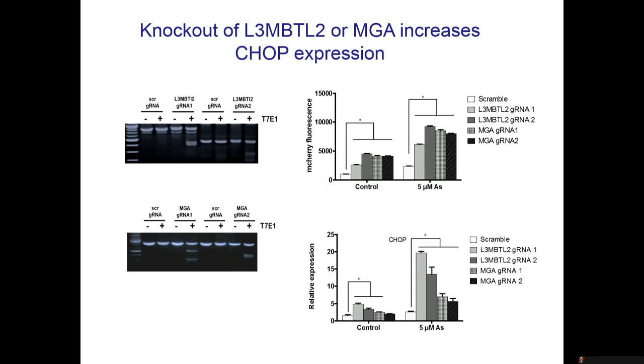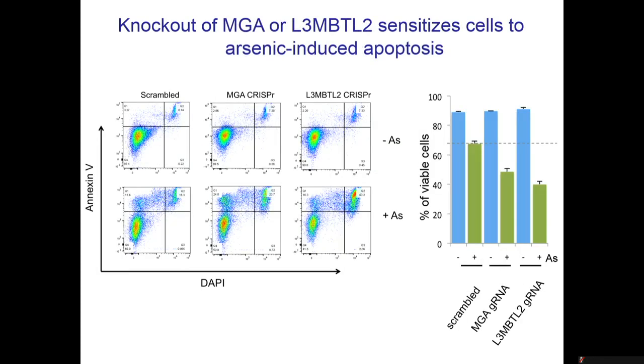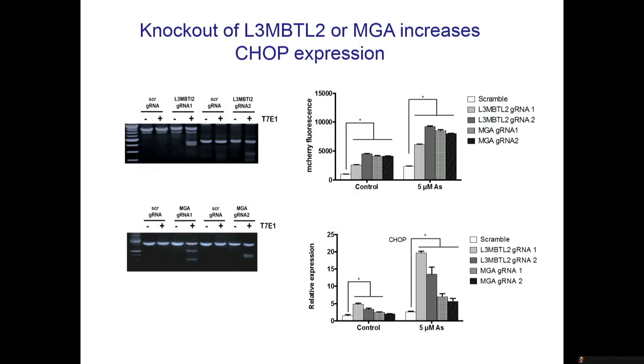So first, you need to validate this. Essentially, how do I go back? Okay, so we use this T7E1 assay. Essentially, this assay tells you whether there's a mutation, an insertion or deletion. So here, if you do that, you can see that different guide RNAs lead to cleavage, indicating there's a mismatch, meaning that the CRISPR editing happened.